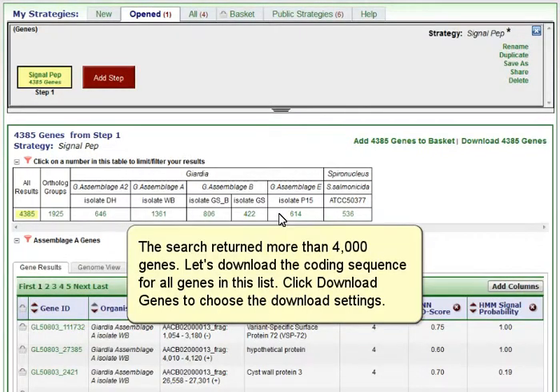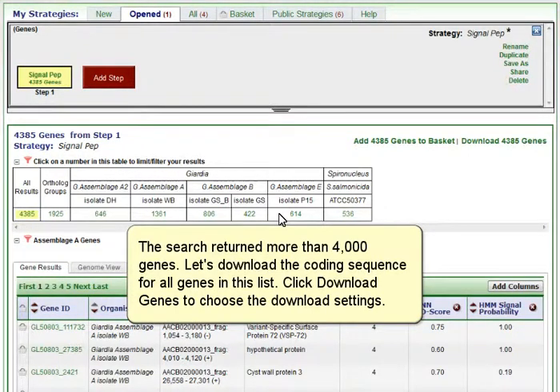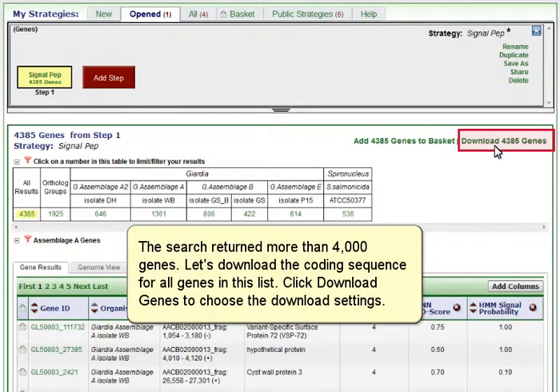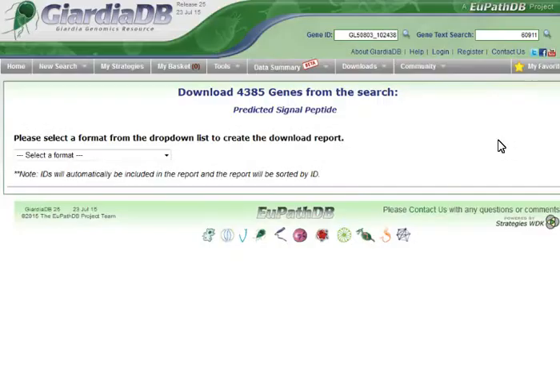Running the search with default settings will return genes with predicted signal peptides from all organisms in GiardiaDB. The search returned more than 4,000 genes. Let's download the coding sequence for all genes in this list.